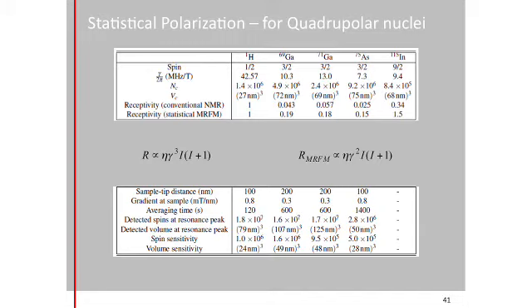Okay. You can also define different receptivities in terms of MRFM receptivity versus the conventional inductive receptivity. I won't go into the details about that, but you can basically find that the receptivity for MRFM is actually scaling much better with the spin number than with conventional NMR. So you have some better chance of measuring these high I spins than you do in a normal NMR measurement.